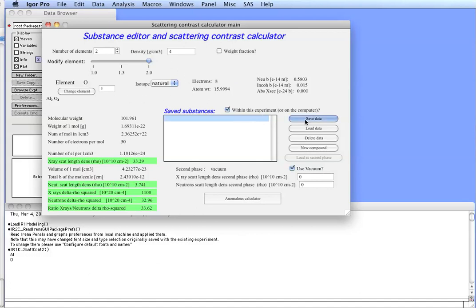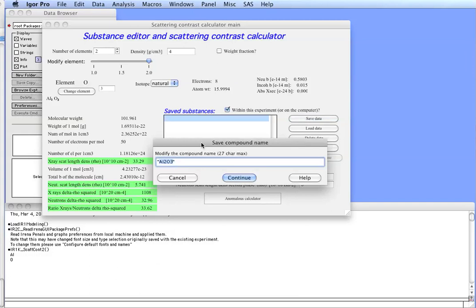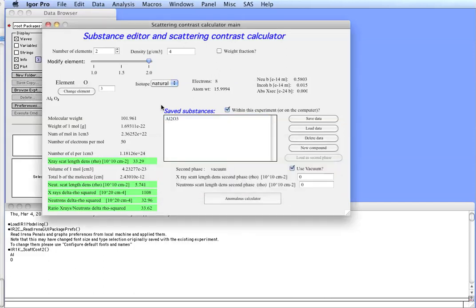And now we can save our Al2O3 inside this experiment. So, we hit button Save Data. We will give it any name we want, but the default one is a chemical formula. And we hit Continue. Now we have Al2O3 saved in here.